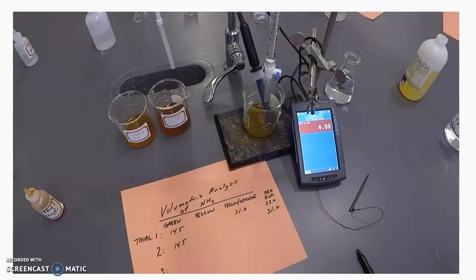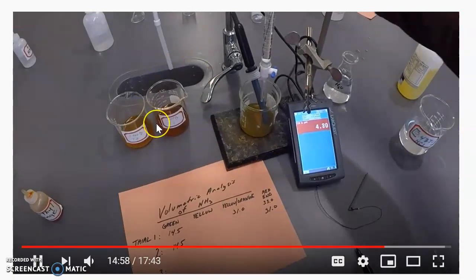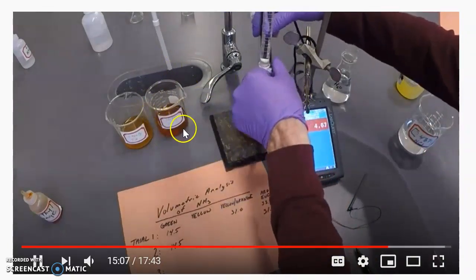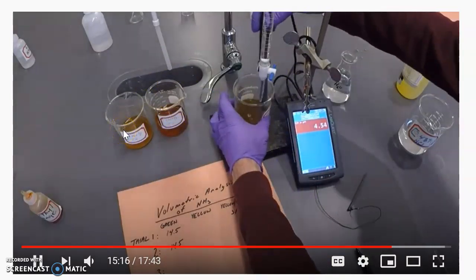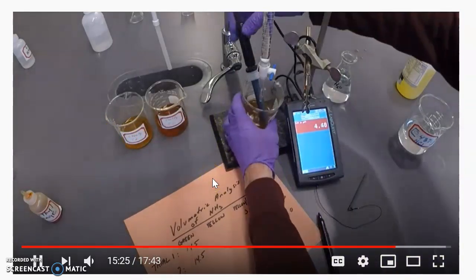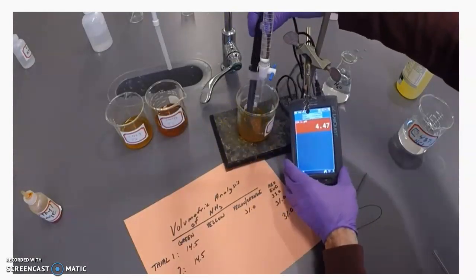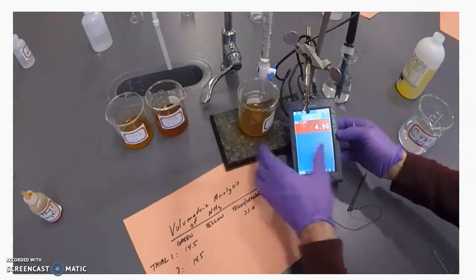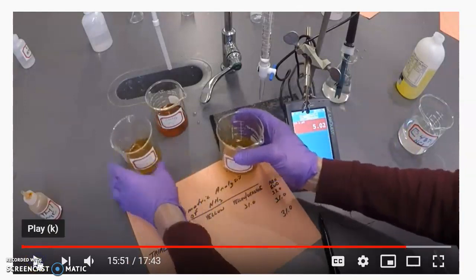So if you look on the side here, I think you can see my cursor, the trial 1 was too far, and then trial 2 is at his end point. So we're giving you the data for the second trial and the third trial. And we have that a little bit more exact numbers, what I showed you. So there it is. We've got our 2 endpoints.